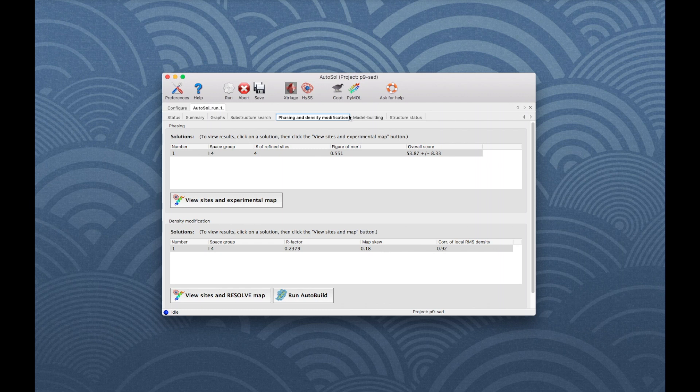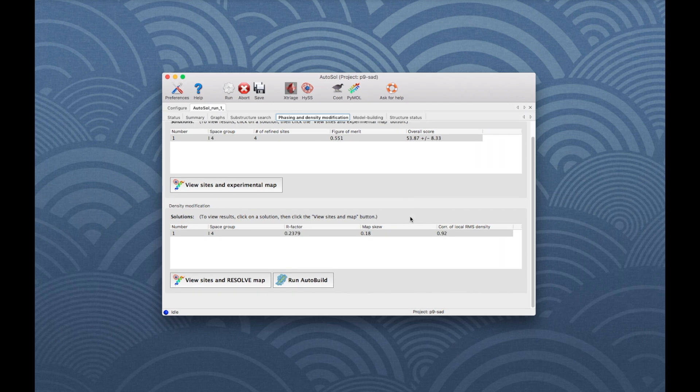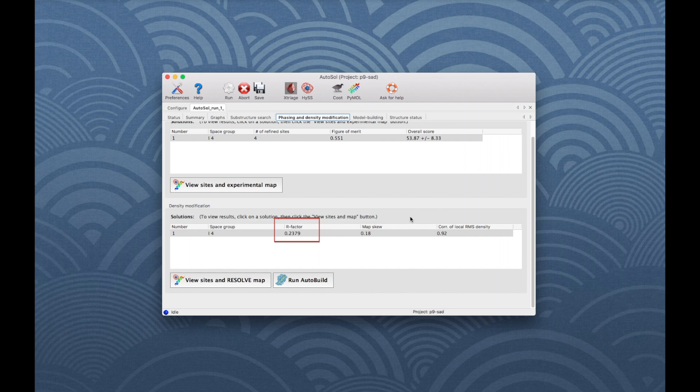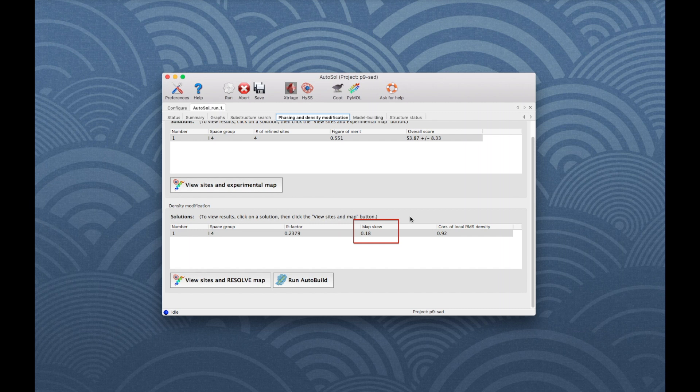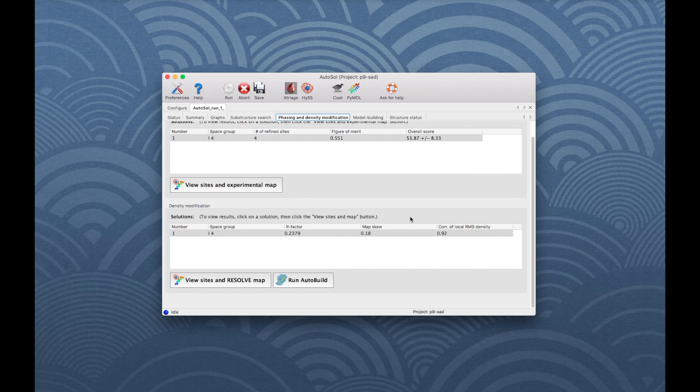Go back to the Phasing and Density Modification tab. The lower part shows the solution from density modification. An R-factor below 0.3 is ideal, but a low value does not guarantee a usable solution. Note that this is the R-factor for density modification, not the crystallographic R-factor for model versus data. The skew is a measure of the deviation of the distribution of electron density values in the raw phase map from a Gaussian. A skew of 0.2 is usually very good.